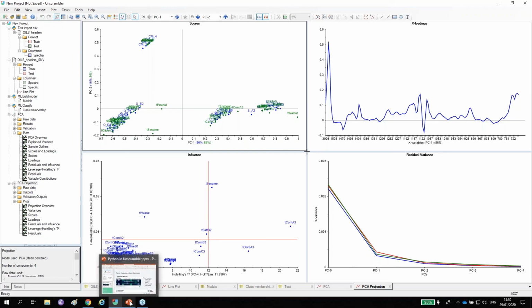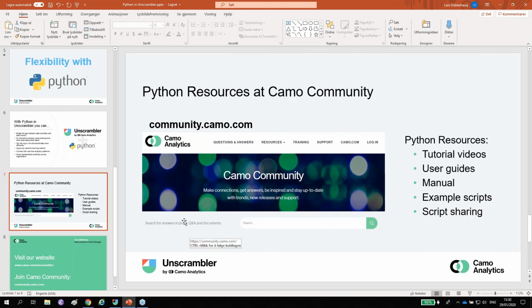So I hope this was a useful introduction to Python scripting in Unscrambler.